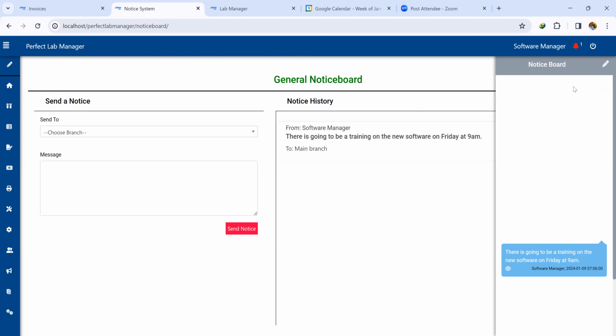We have done it in such a way that it does not allow staff to staff chatting, because our experience and research shows that it actually does not help to make the system efficient. People spend time on the platform chatting rather than doing work. But for flow of information from management to staff, vital information, the notice board is key so that information can be disseminated across board to everybody as and when it's needed.